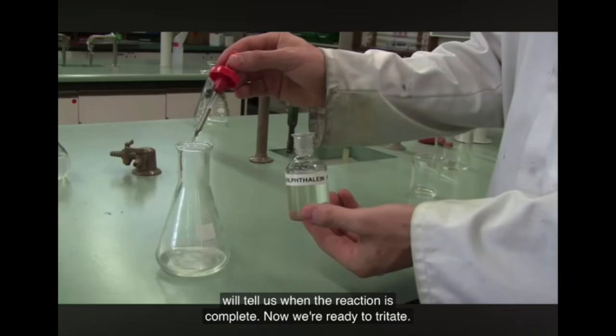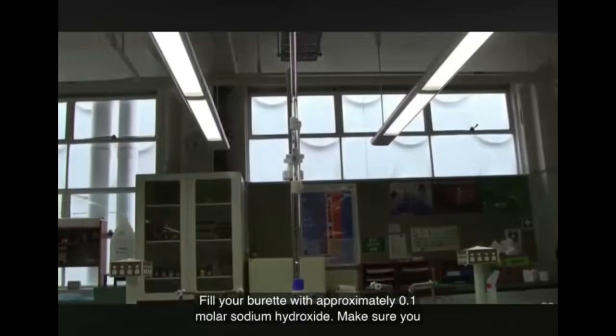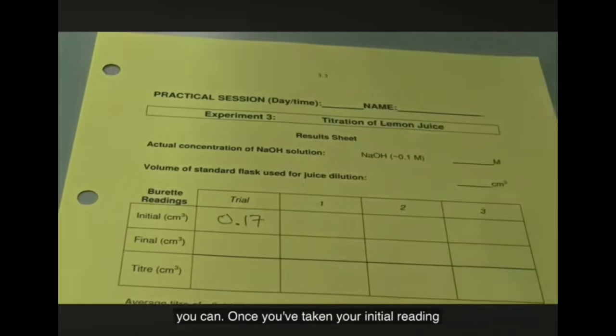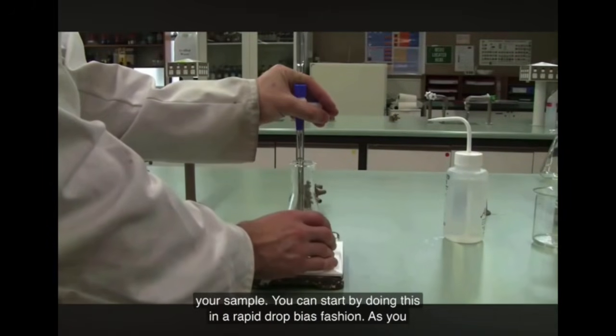Now we're ready to titrate. Fill your burette with approximately 0.1 molar sodium hydroxide. Make sure you remove the funnel from the top. Make sure there are no air bubbles in the bottom. And then take your initial burette reading to 2 decimal places as best you can. Once you've taken your initial reading, you can then start titrating. You can start adding your sodium hydroxide to your sample.